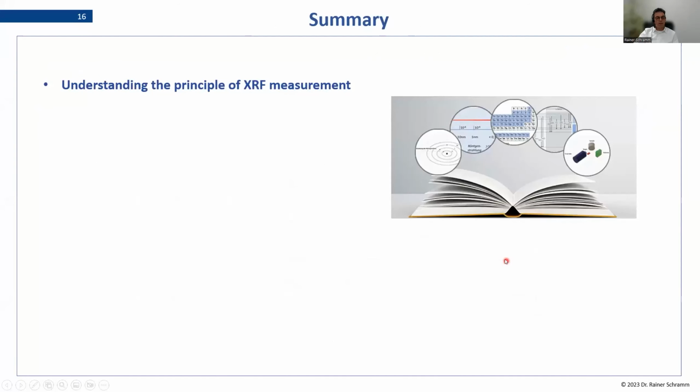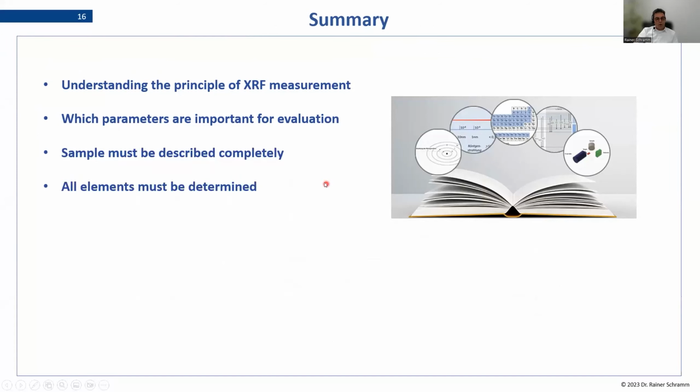So let me summarize the whole thing. First of all, to use standardless software, you have to understand the principle of XRF. And very important, you have to know every parameter which is important, especially sample thickness, particle size effects, dilution, and defining the matrix in the right way. And all elements must be determined. This is also something I didn't mention yet. Of course, you can only describe the full sample if every element which can be analyzed is analyzed and taken into account.